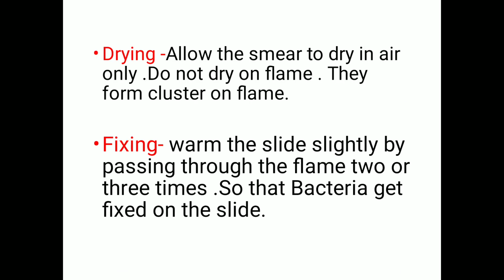Next one, drying. Allow the smear to dry in air only. Do not dry on the flame, as the bacteria form clusters on the flame. We dry the smear by keeping the slide in air for one or two minutes. After drying, fix the slide. That is the fixing process: warm the slide slightly by passing it through the flame two or three times, so that the bacteria get fixed on the slide.